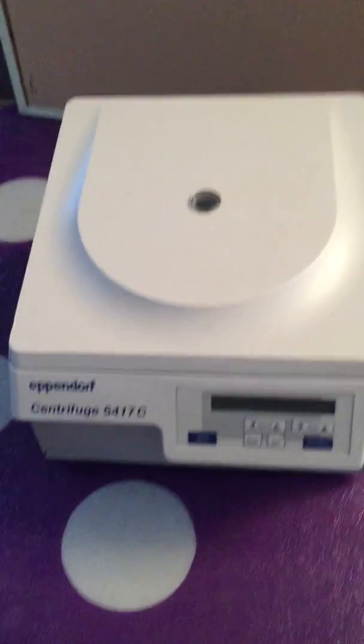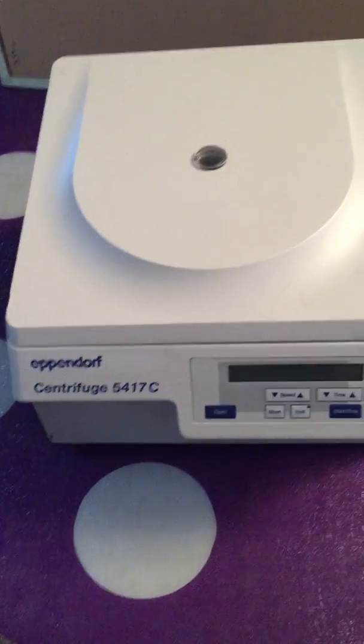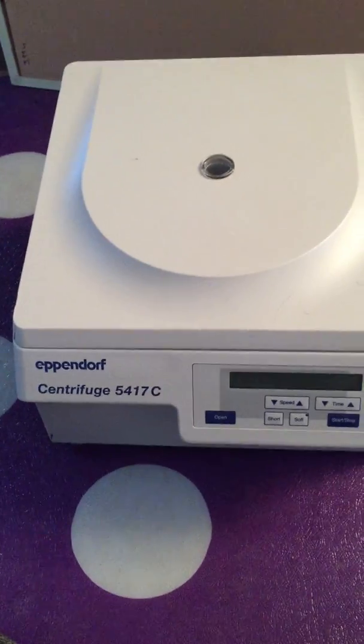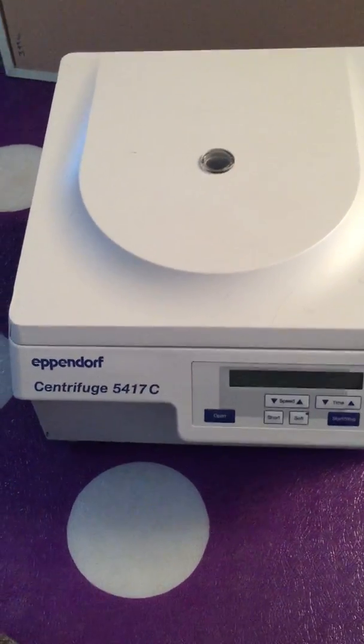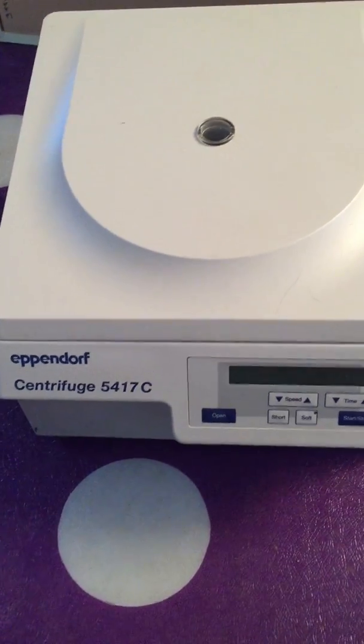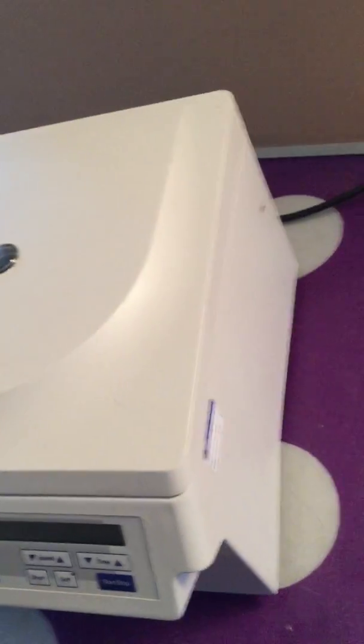Here's another wonderful operational condition by each project. This is an Eppendorf 5417C, it's really nice. It's got this small slight crack here and it's also got this crack here in the back, but it's really beautiful in operation and will last a long time. Whoever buys it will be doing a great deal.